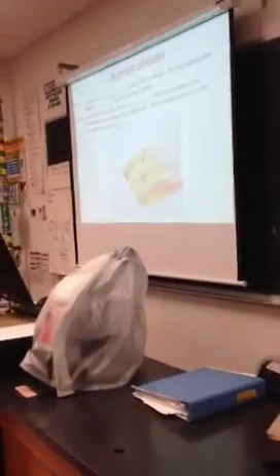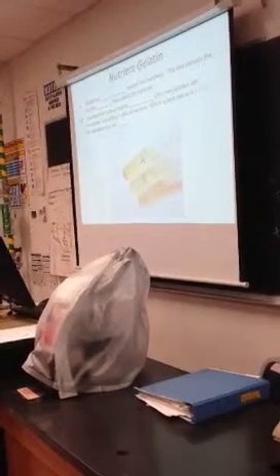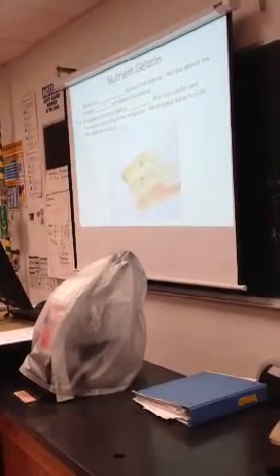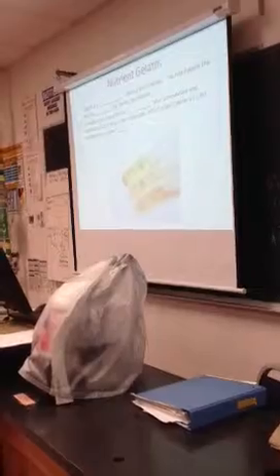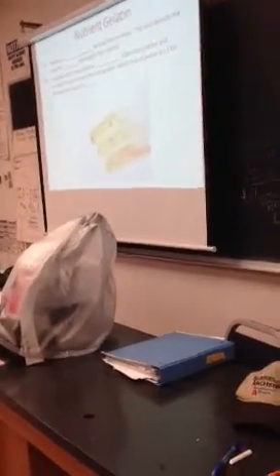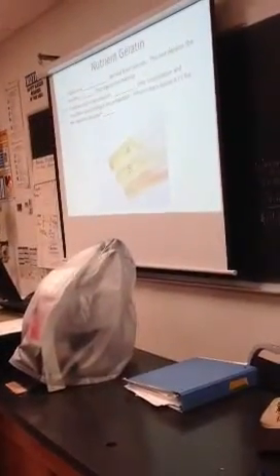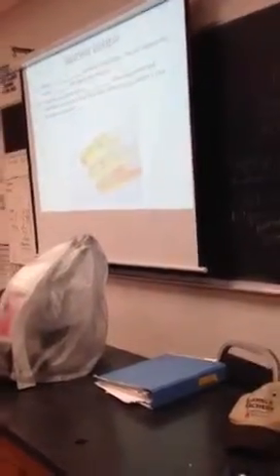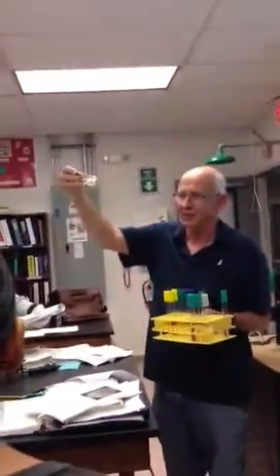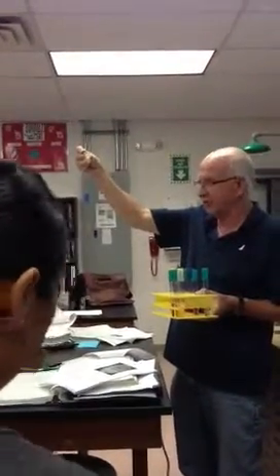Okay. All right, let me do this real quick while we're looking at this. Some of you didn't see a really good example, so I'm going to show you one. If your gelatinase test didn't work very well, it's because you didn't inoculate it heavily enough. But look right here. See the two tubes? Which one's positive for gelatinase? The one at the bottom because it's liquid. Which one's negative? The one at the top because it's still solid.